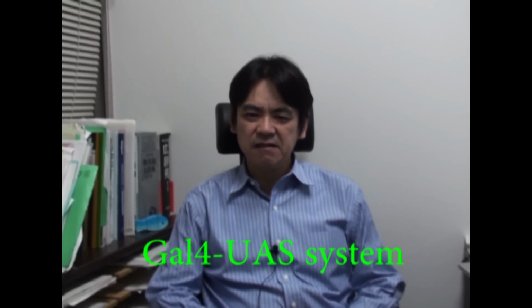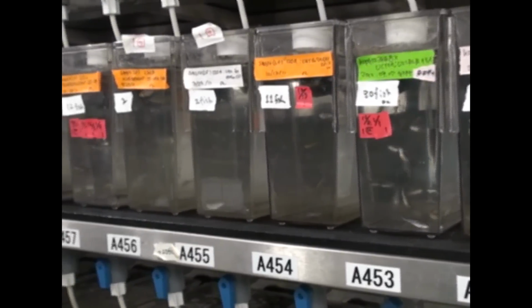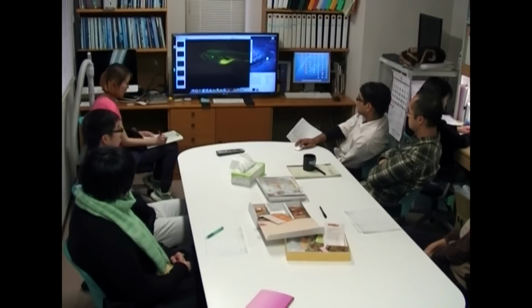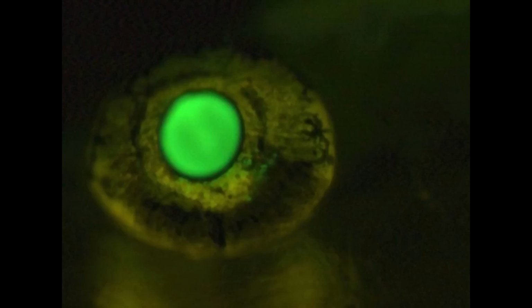Another important technique is the GAL4-UAS system. GAL4 binds to UAS and activates transcription of a gene placed downstream of UAS. In my lab, we are doing gene trap screens and generated more than 1,000 transgenic fish lines that express GAL4 in different tissues. Each tank has a different line.